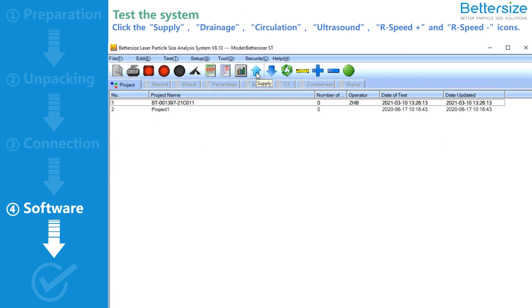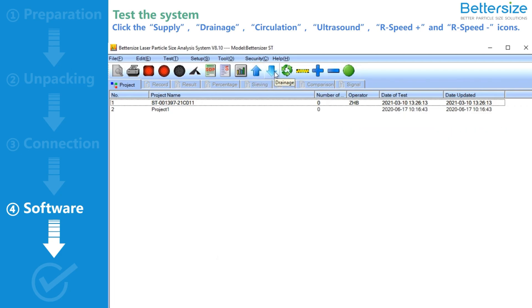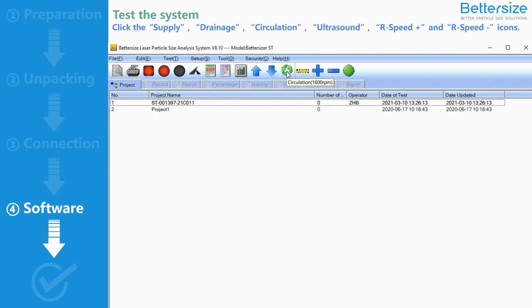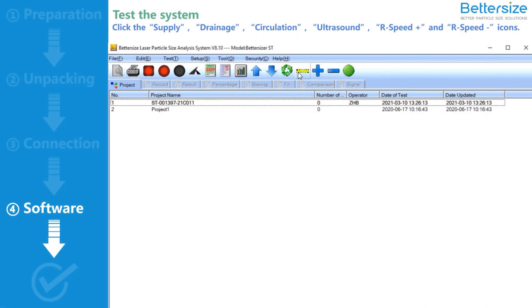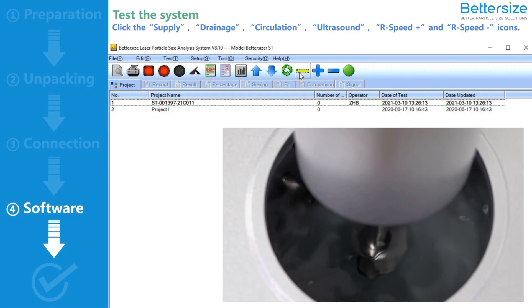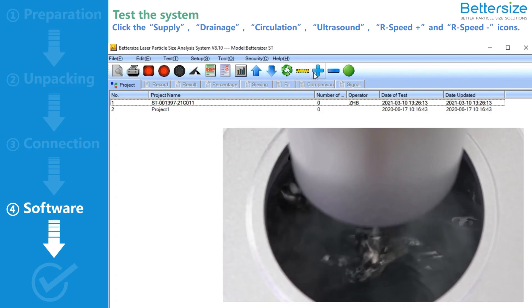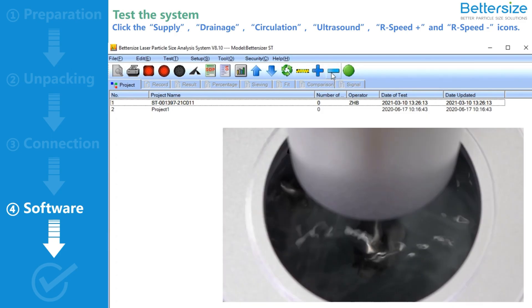Then, launch the software and click Supply, Drainage, Circulation, Ultrasound, R-Speed Plus, and R-Speed Minus icons to test the system. If the ST works properly, the installation of the ST is complete. Enjoy your particle exploration journey.